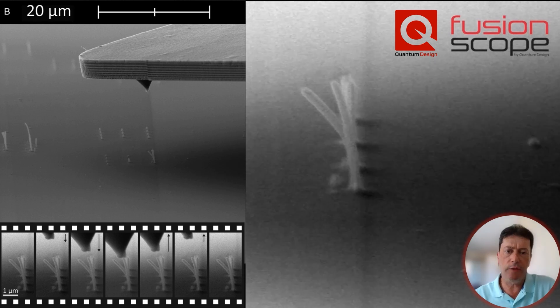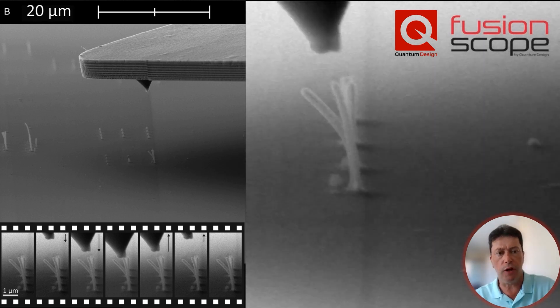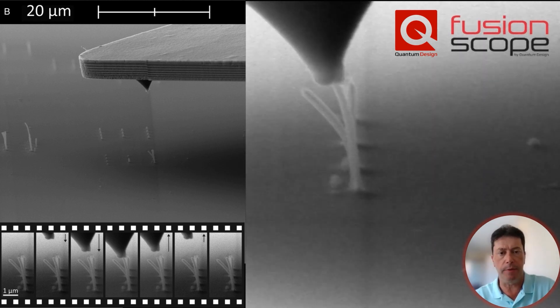Last time, we demonstrated how the FusionScope simplifies the search of nanometer scale features in a sample.